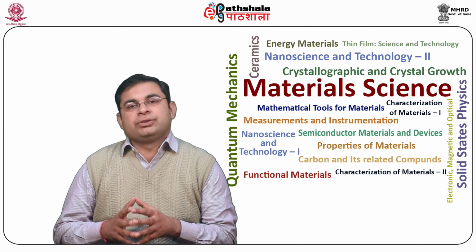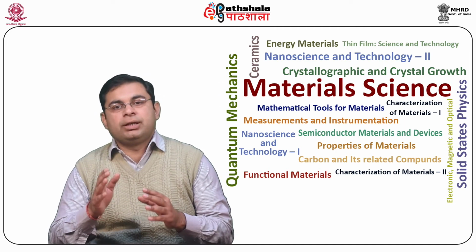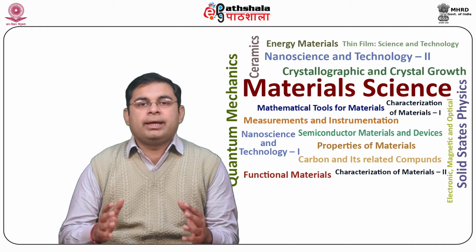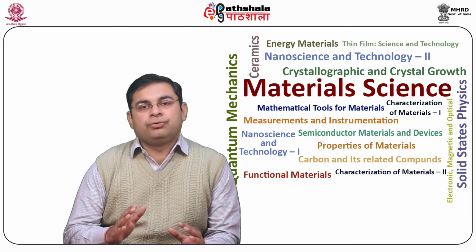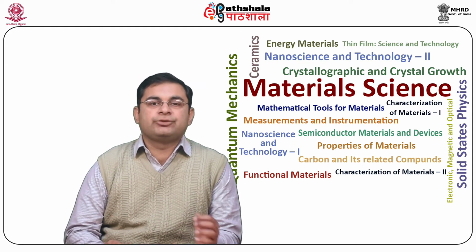Emission of X-rays is a competing phenomenon for the Auger process, since the energy difference between the core and the outer levels can equally be realized in the form of characteristic X-rays. Therefore, the sum of the yields of the Auger emission and X-ray emission is 1.